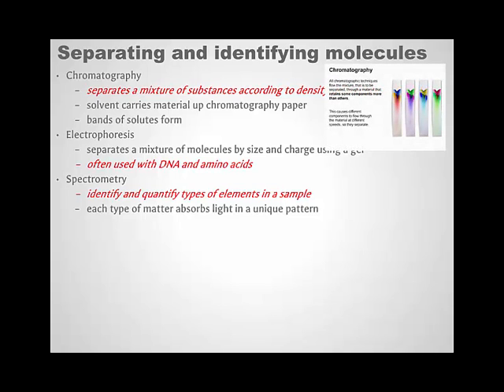So this is chromatography. This is the part that's hanging in a solvent, and as the solution rises up the paper, it separates. This would be different water-soluble markers that separate out, because markers are made of different pigments, and the pigments separate out.